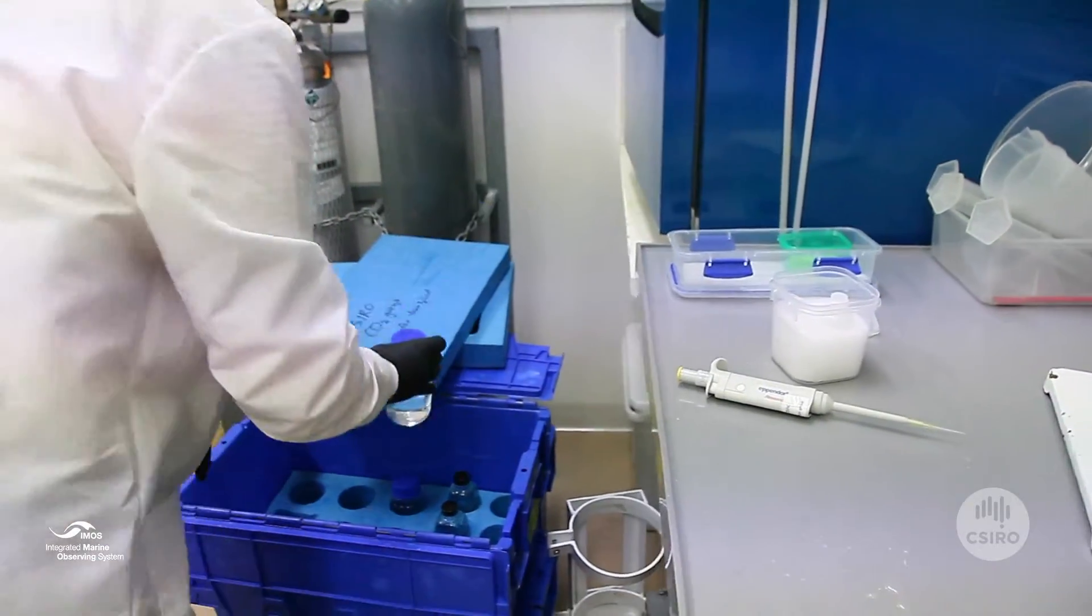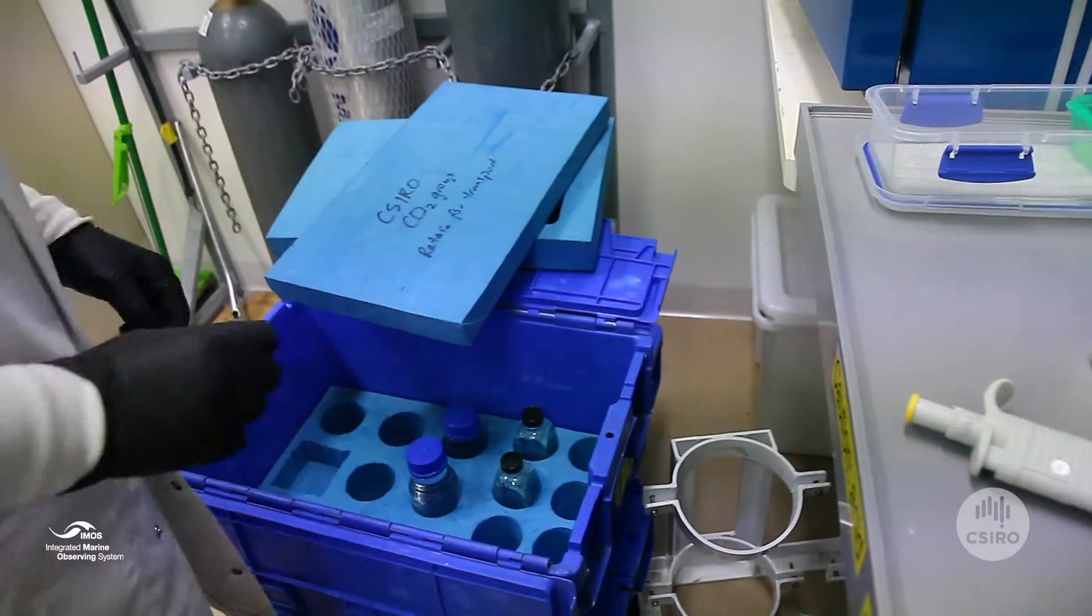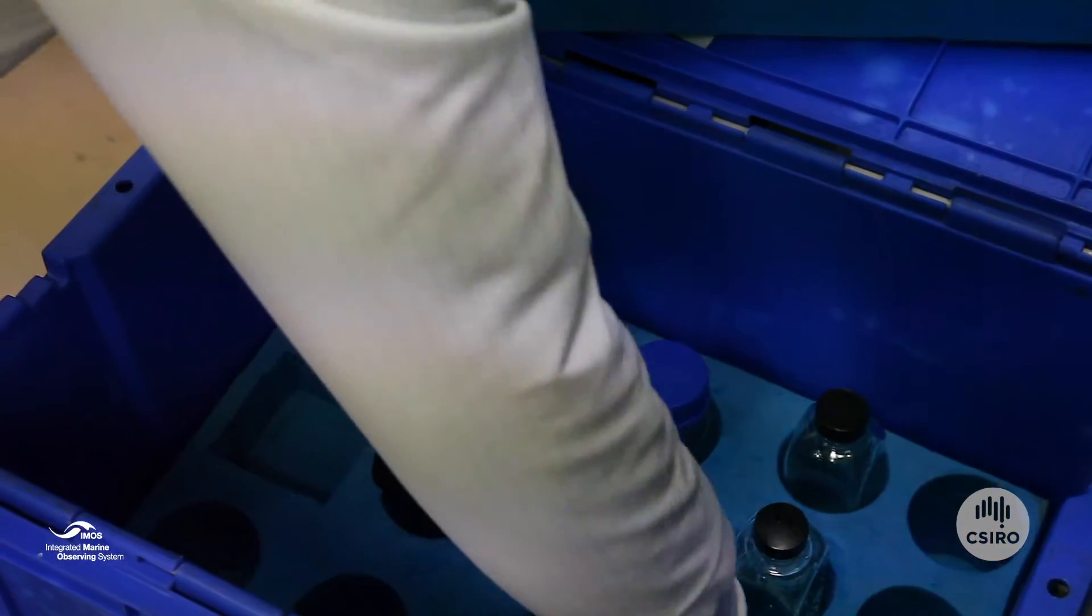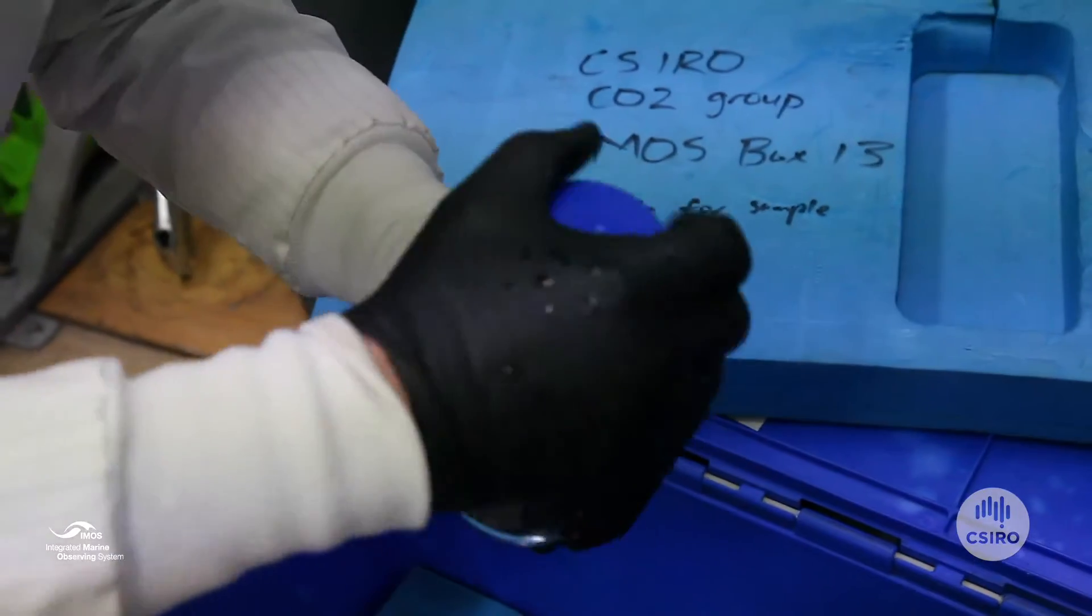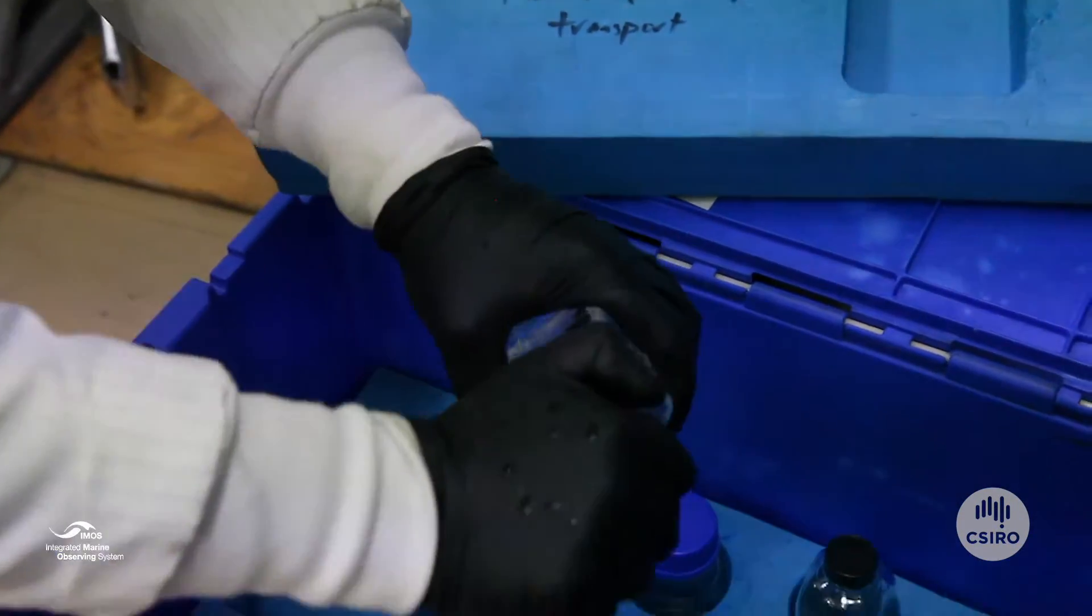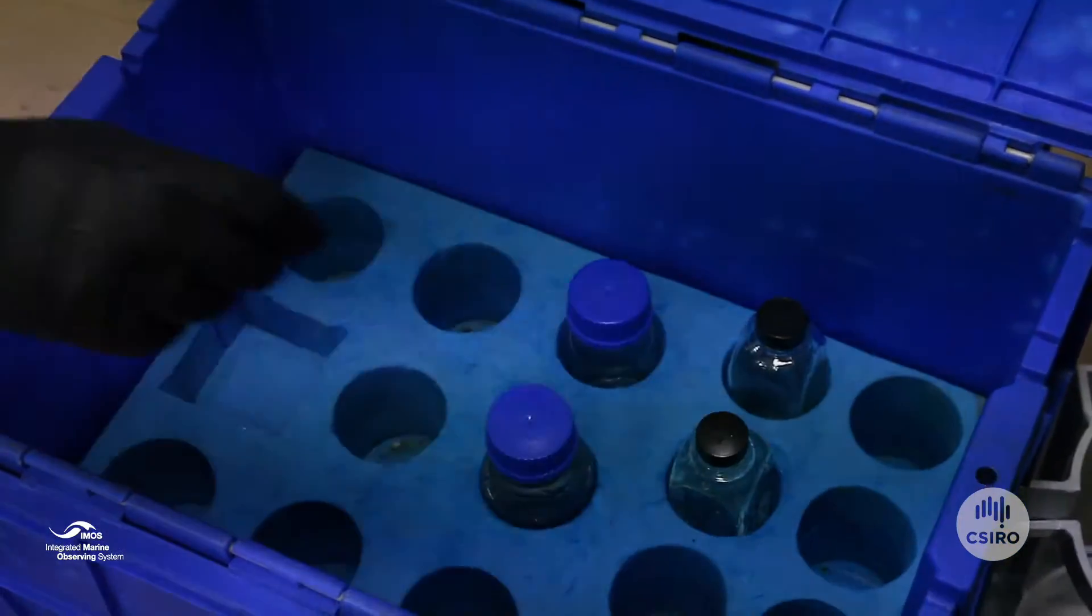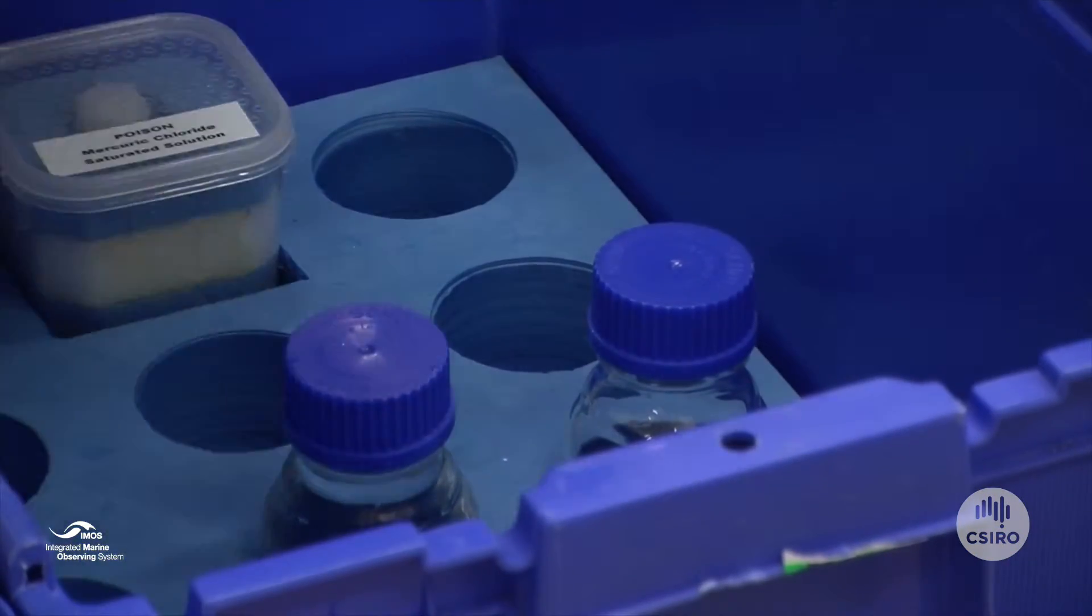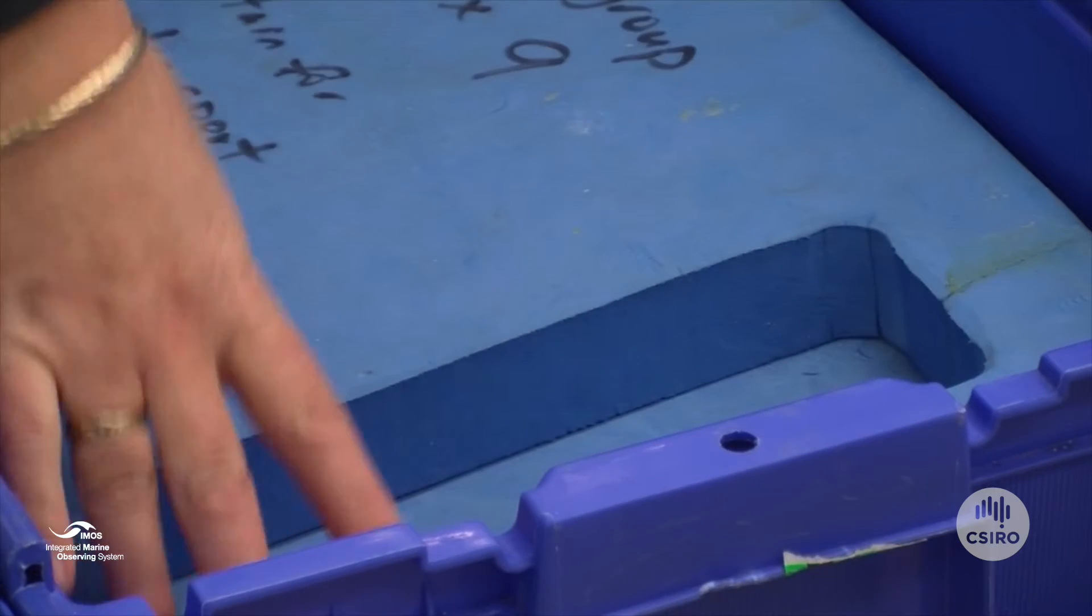When you finish sampling for the day, please tighten the lids again because changes in temperature can make them quite loose. Put the mercuric chloride back in the box and the lid back on, and you're ready to go.